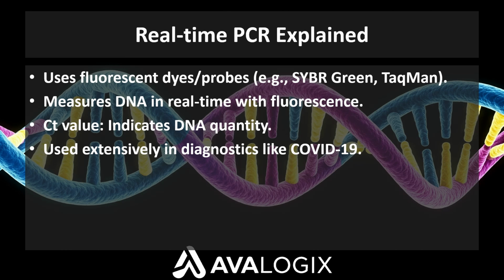There are two primary detection methods. SYBR Green, a dye that binds to all double-stranded DNA. It is economical and easy to use but less specific, as it cannot distinguish between target and non-target products. TaqMan probes. These are labeled target-specific probes. When bound and cleaved by the Taq polymerase during extension, they emit a fluorescent signal. This method is highly specific and preferred for diagnostics. qPCR is vital in gene expression studies, viral load quantification, pathogen detection, and cancer research.